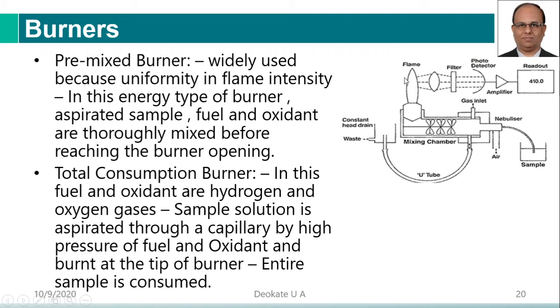It will have many functions. I will show you the functions later on. So it converts liquid into small droplets. Then the flame temperature will thermally excite it, and the excited radiations will be filtered by this filter, and they are detected, amplified and recorded. This is called a premix burner.